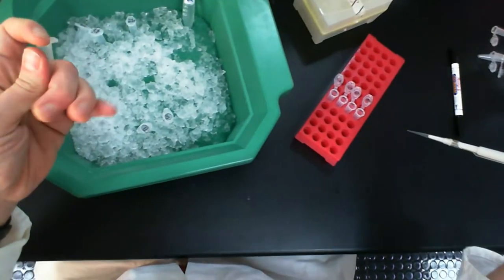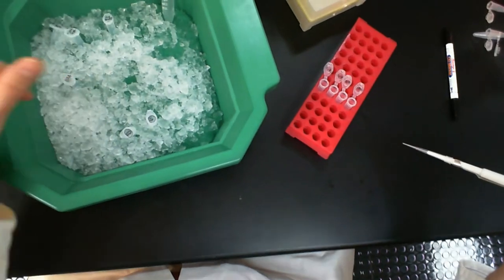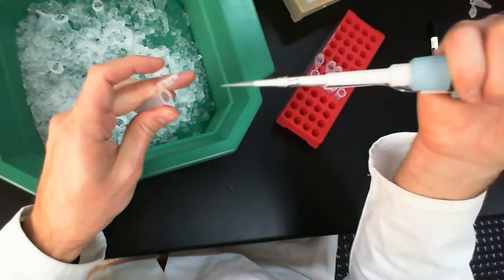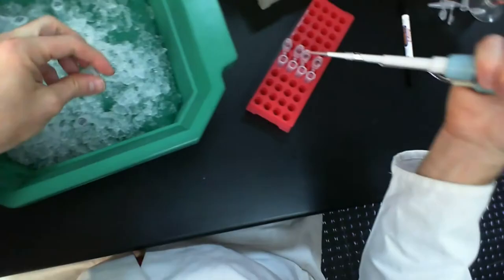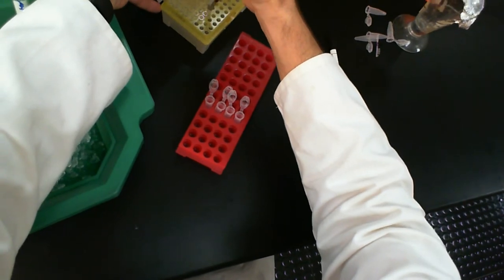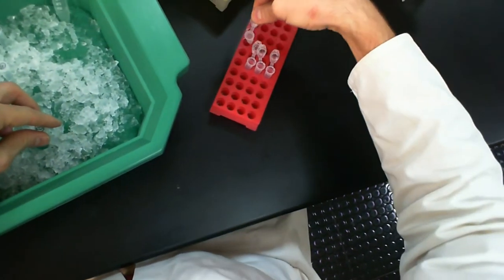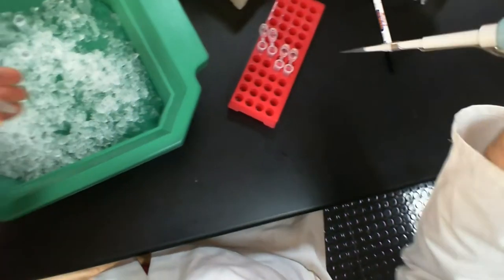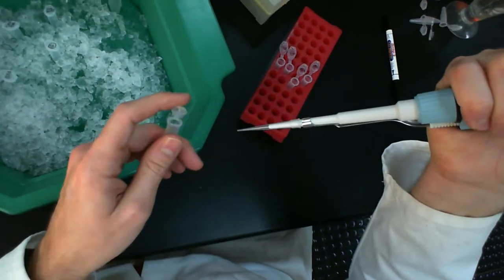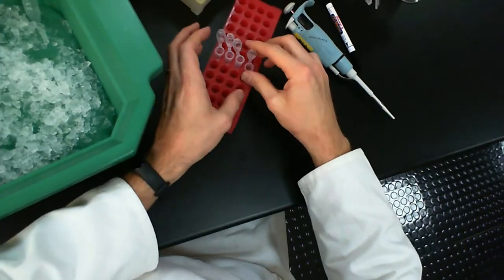So I've done my BSA, and again, I got just distracted to tell you about this stuff, but I know that I finished my BSA because all the tubes are moved over. Okay. So at this point, all I've got left is just the enzyme. And so again, the first two tubes get SmaI. So I'm going to add 2 microliters of SmaI to these. Okay, and that's going to go in. And again, this one does not get SmaI. That's right. So, oops. So that should be over. That should be over. So BamHI. And again, you can move this one over here already, so you know how to add BamHI to this one. Add BamHI to tube number 3. And here we are. Okay. Now you can close all of these.